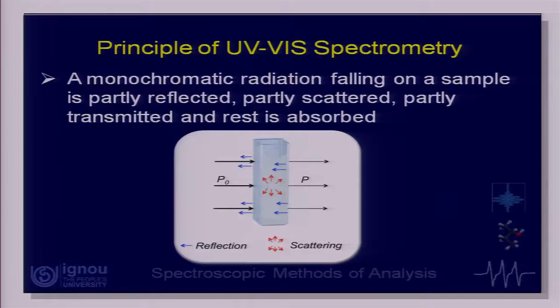Now, let us see what we do here. How do I get a spectrum? I take my sample which I want to make measurement of in some kind of a container. We will come to that in much more detail in the next session, but for right now, as a matter of concept, we have a container which contains my sample. Then I have a source of radiation, radiation is coming, interacts with this, and then it passes through that, some of it gets absorbed there. And then let's look at this picture here. What basically I am referring to here is that suppose I have this container here. In this container there is some sample which I want to make measurement of.